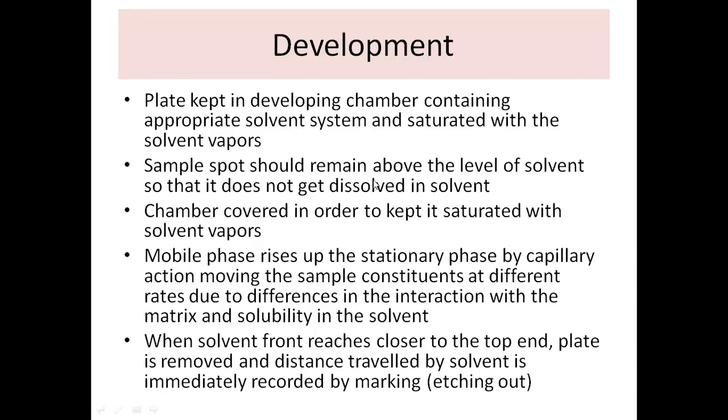You have to scrape out the powder slightly so that you can mark the level of the solvent front. Is that clear to you?